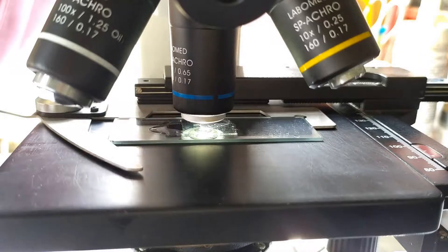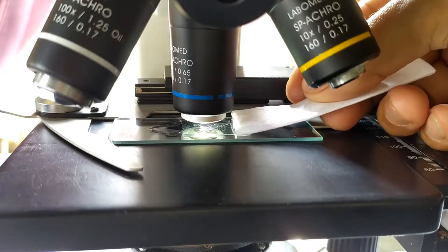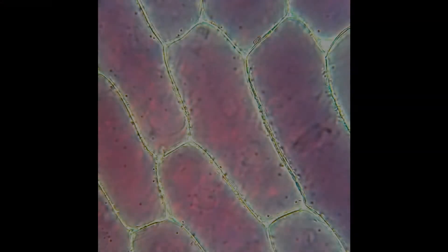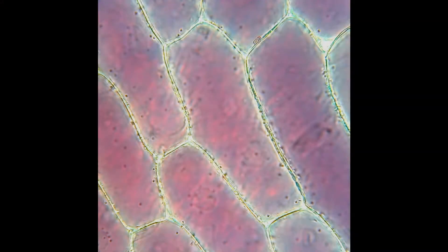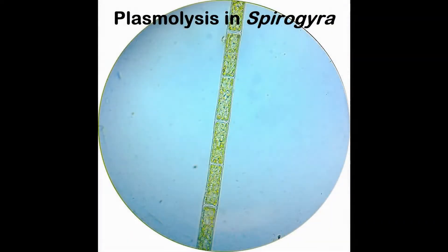Now replace the sucrose solution with distilled water by following the same process of blotting. After a few minutes, you'll find that the plasmolyzed cells regain their turgidity as the shrunken protoplasm of the cells begins to slowly swell up and fill the interior of the cells. This is called deplasmolysis and results from the process of endosmosis of the external fluid into the cells.